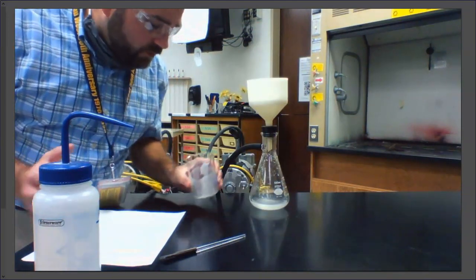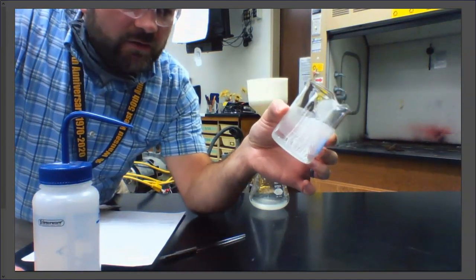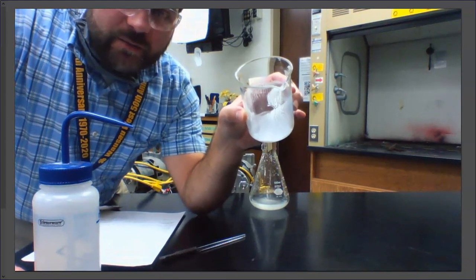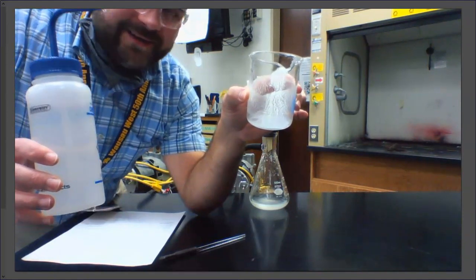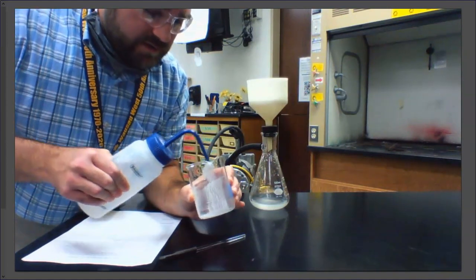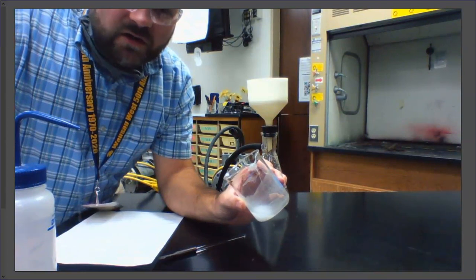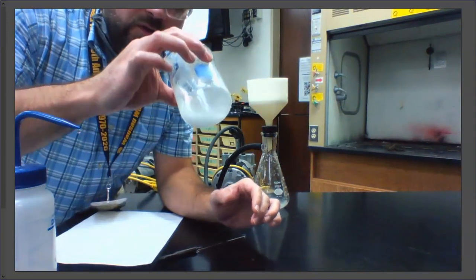All right, so I've poured through as much as I can, but you'll notice, if you can see, I still have white stuff in the beaker. And I want to transfer all of that over. I don't want residual product that I'm trying to calculate and collect stuck in my beaker. So this is where we go back to using distilled water. This is a wash bottle with distilled water, and it doesn't matter how much I use. What I'm going to do now is rinse the sides and try to collect as much of this as I possibly can. Because if I don't collect it, it is going to completely screw up my results. I don't want to leave 30% of my sample stuck in this beaker.